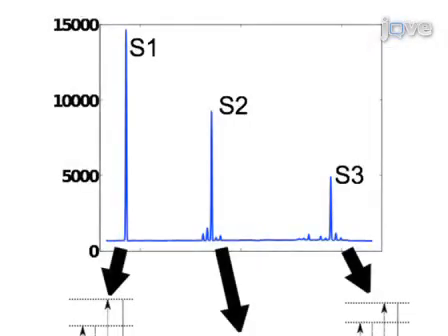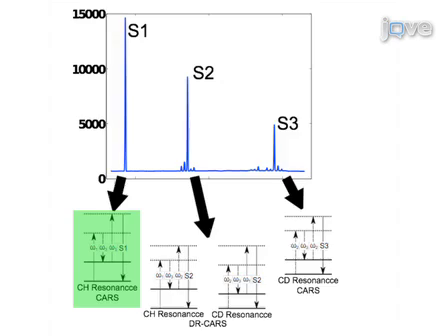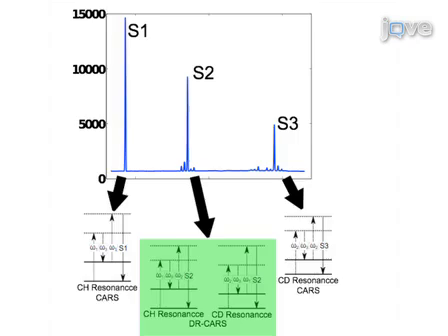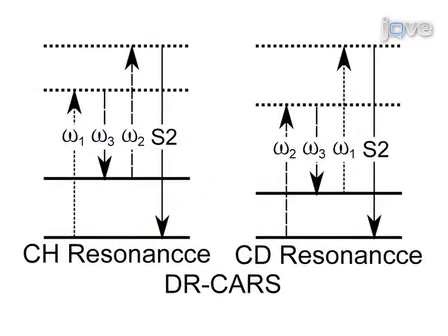In spectroscopic mode, the CARS microscope allows us to observe 3 coherent Raman signals of interest: a CARS signal probing the CH stretching vibration, a CARS signal probing the CD stretch mode, and a DR CARS signal probing both. In the diagram shown here, dashed arrows indicate photons from the laser and the OPOs, and solid arrows indicate the resulting signal. The solid horizontal lines indicate the energy of the Raman vibration and give a visual representation that, in DR CARS, mixing the same 3 input photons simultaneously probes 2 different Raman vibrations.